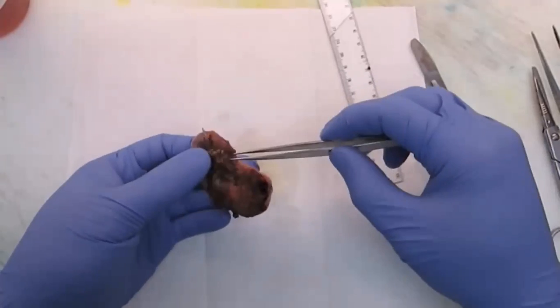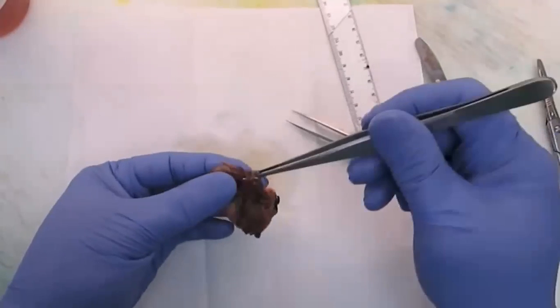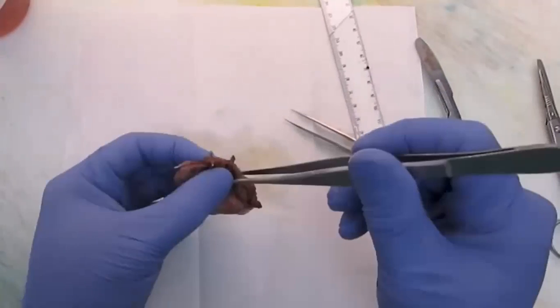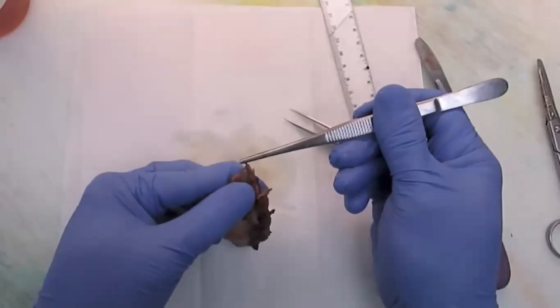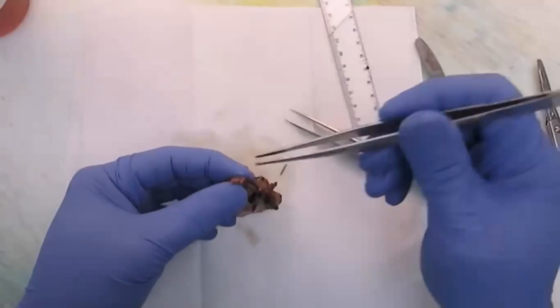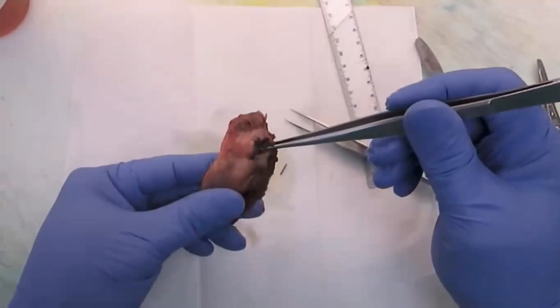So that's why it's very important that the one performing the gross examination is very knowledgeable about the different tissues in our body. Has staples. This is the artery, and this is the cystic duct. So I just make a comment. I pull out the staple and say the cystic duct measures 0.2 cm at the margin of incision. That's it for the outside of the gallbladder.